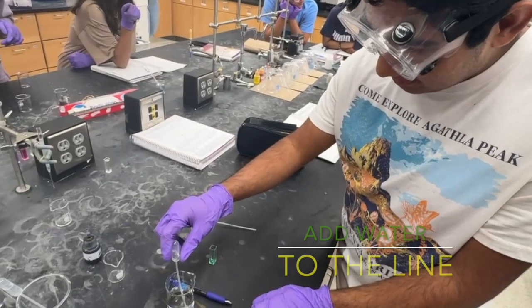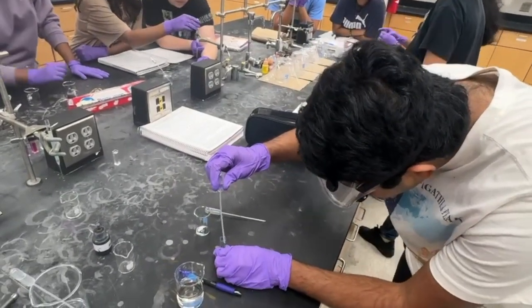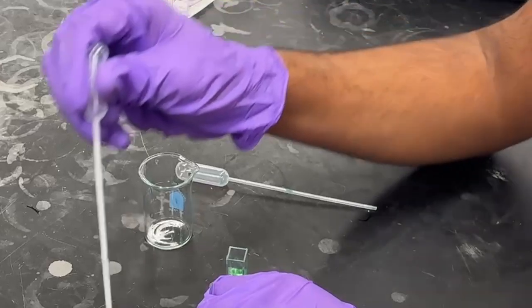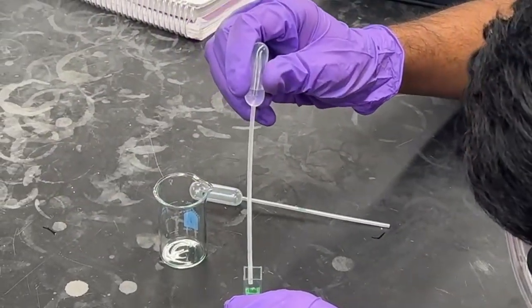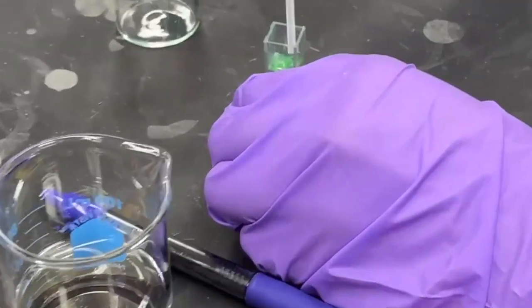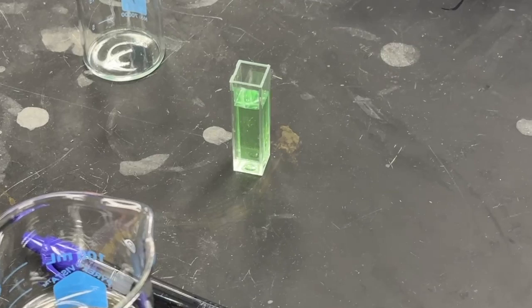To prepare the cuvette, we start by filling it with distilled water up to the designated line on the side. Make sure it's neither overfilled nor underfilled. This is how the cuvette should look, filled to the line and correctly aligned for accurate results.